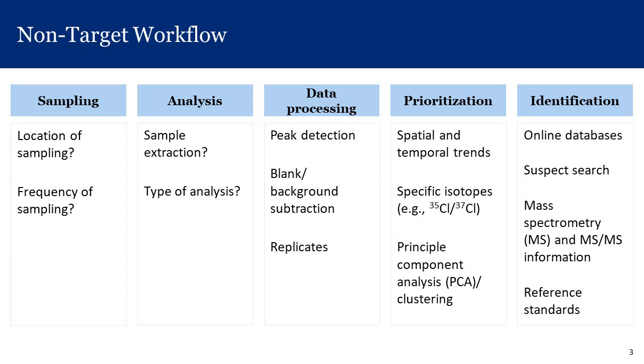And if you use these reference standards, you can, on the one hand, really confirm the chemical structure of a compound. So you can really, with 100% certainty, say, okay, this is the compound that I think it is. But another important aspect is also that you can actually quantify. So you can determine the actual concentration of a chemical.